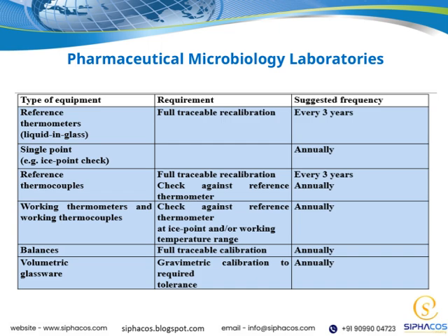These tests help us verify that manufacturing environments, raw materials, and finished products meet strict regulatory standards. The key point here is that microbiology labs act as the frontline defense against microbial contamination. They help us identify potential issues early and maintain the integrity of pharmaceutical products.